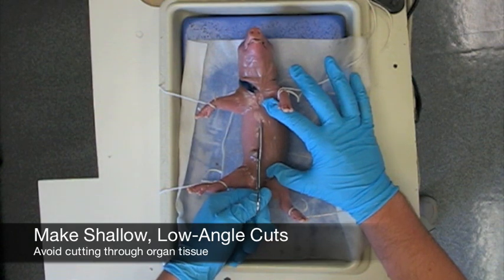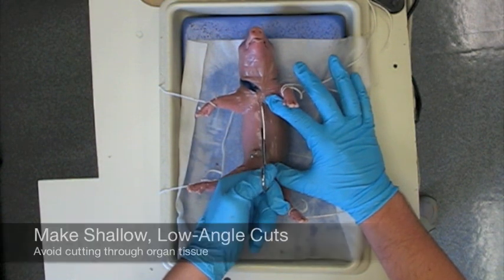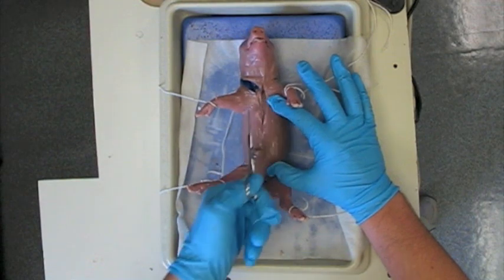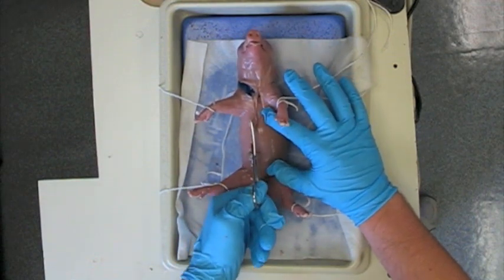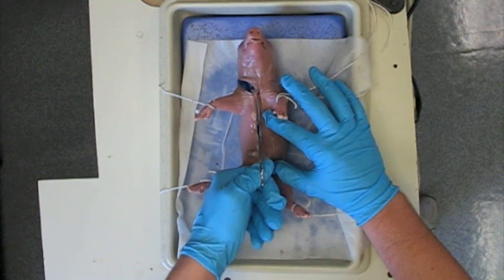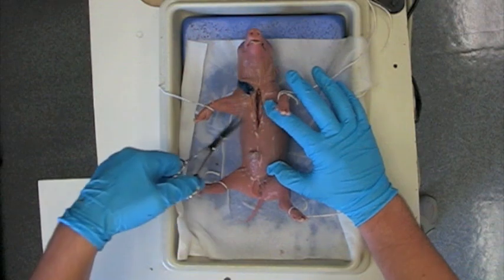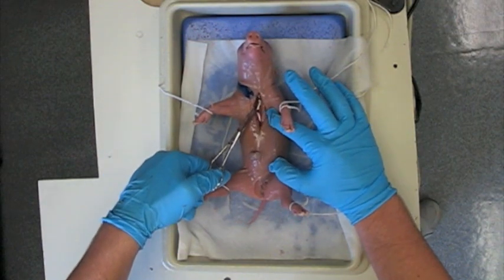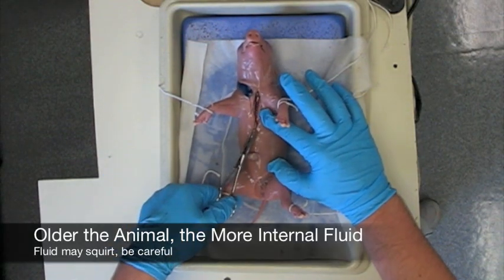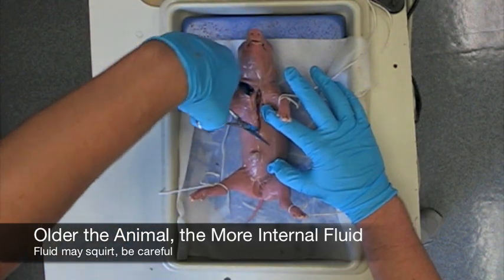For any cut in these animals, you want to make a shallow cut — nothing that is going to be too deep to nick an organ. If you have to, you can make one or two different cuts to get through first the outer tissue and then through the sternum. It is pretty normal to hear a lot of clicking when you are going through because you are cutting through some premature bone tissue. But remember, as you are cutting, you are exposing the internal cavity of the animal and so a lot of internal fluid might start squirting out.